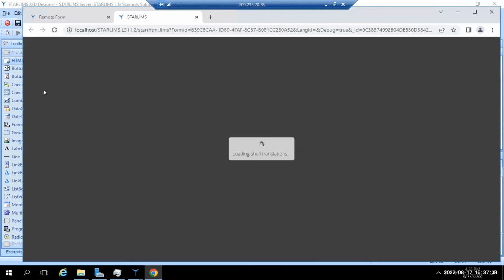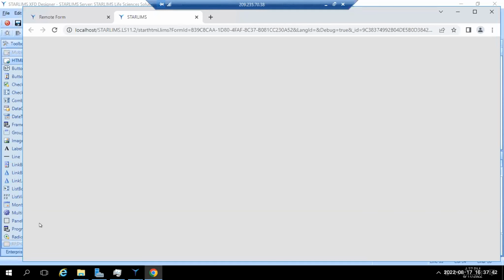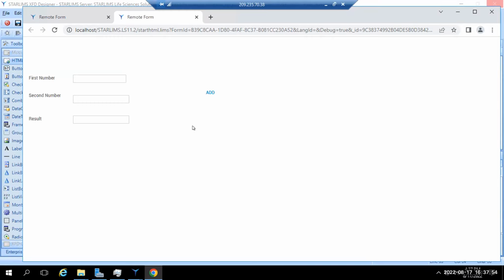And that's it for, we can continue on Friday from this example, and then you guys can try the other examples on your own. But this one, we're gonna enhance it a little bit so that the adding is not done on the client. And we do it on the, yay, right?